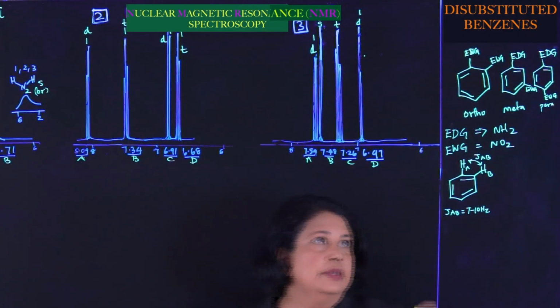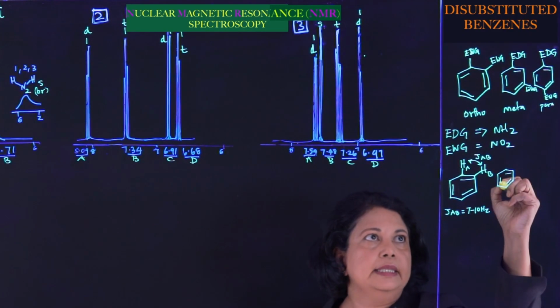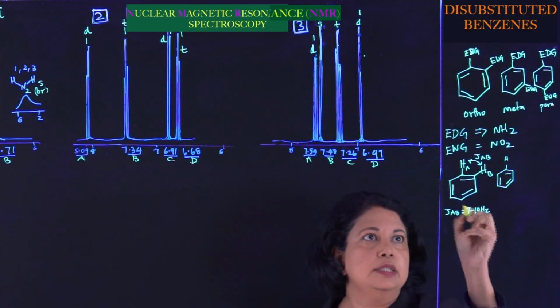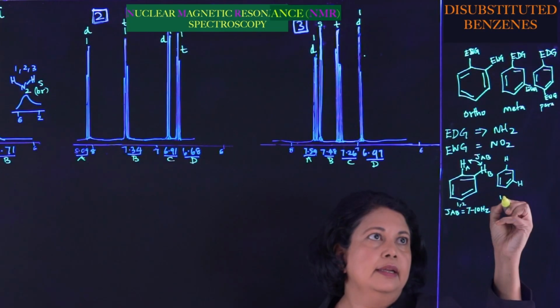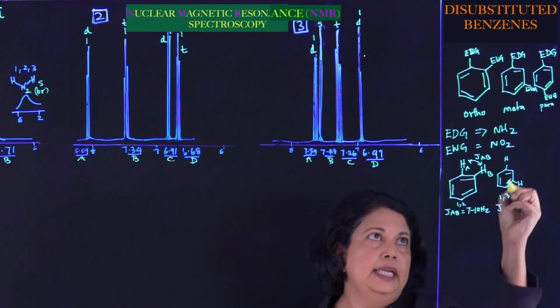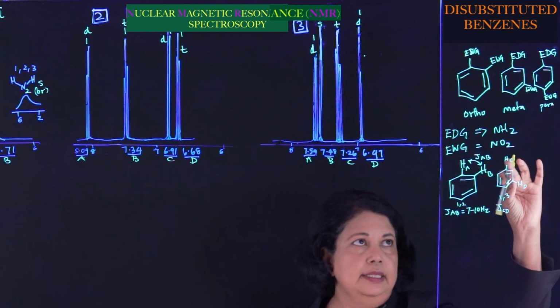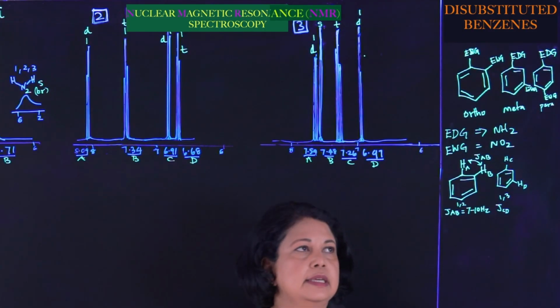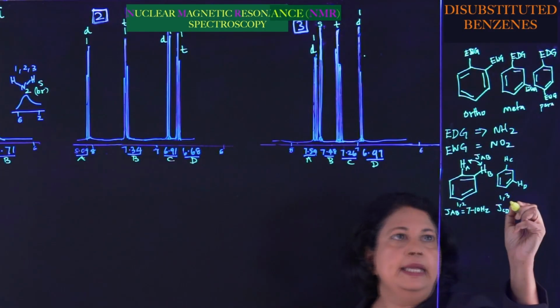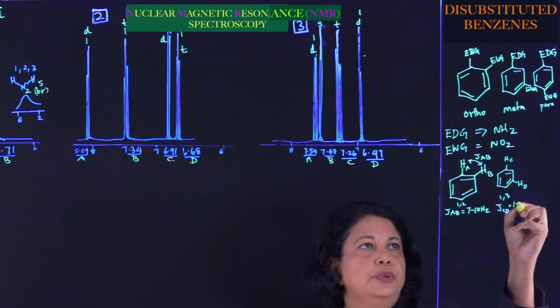Okay. You could have hydrogens that are meta, that means 1,3. So this is 1,2, and you can have them 1,3. And there the J, let's say this is C and D, the coupling constant there, even though it is 1, 2, 3, 4 bonds away, you do see some long distance coupling here, and this is going to be about 1 to 3 hertz.